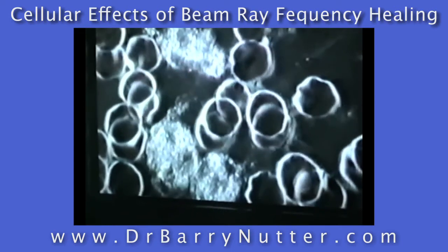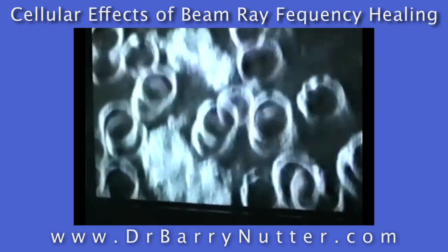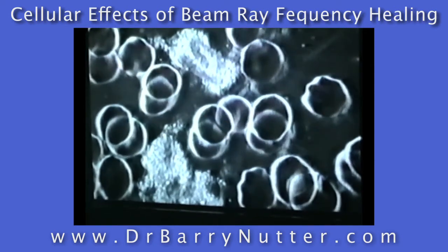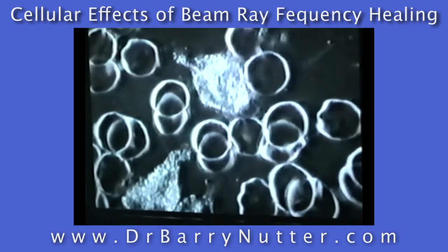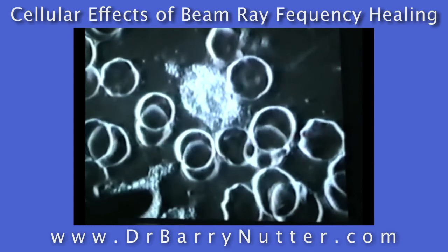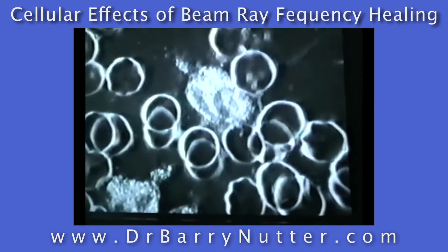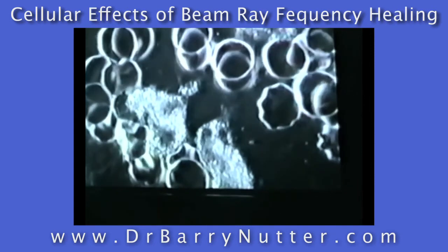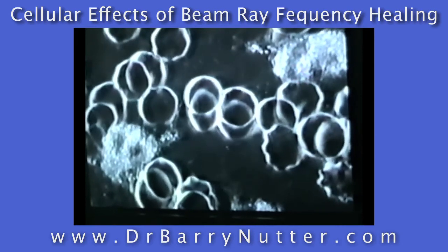Look at the difference in these white blood cells as far as their ability to stream and flow, and to reach out and clean up the area around them. A lot of improvement in the action as far as the special forces being able to really activate. You have several areas that are streaming now. You can see right here where the pseudopod or finger is reaching out. You can see all of this activity right in here — a lot of granulars that are loaded with histamine and enzymes reaching out to digest the debris. You can see a lot of action in all three of these white blood cells, so the light frequencies really have stimulated these white blood cells to wake up and to go to work.